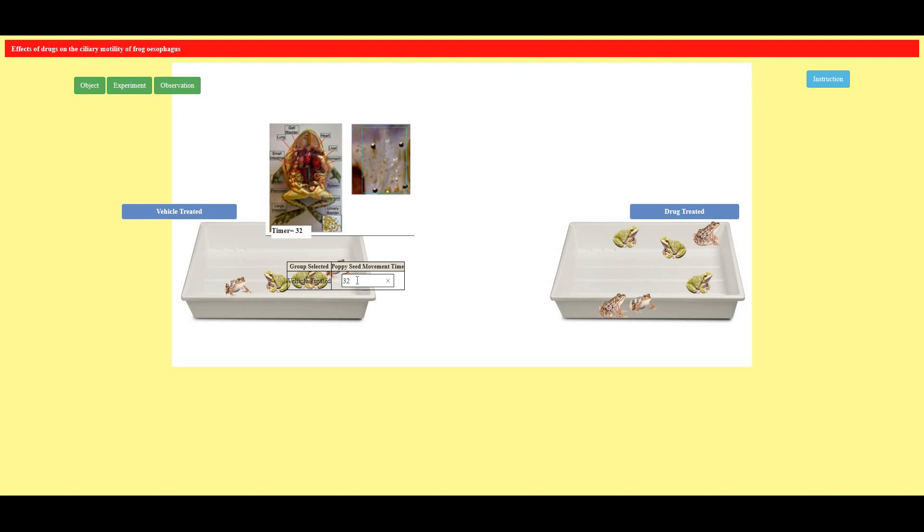Next again I'm selecting another frog here and I'm going to see how much time it is taking to reach the caudal end. That is 31.